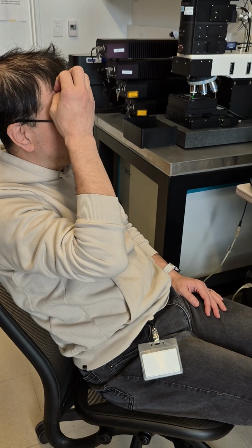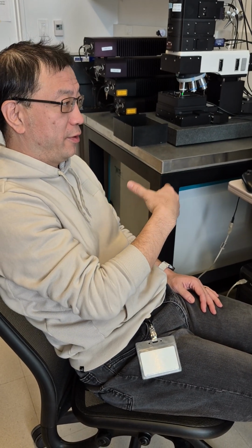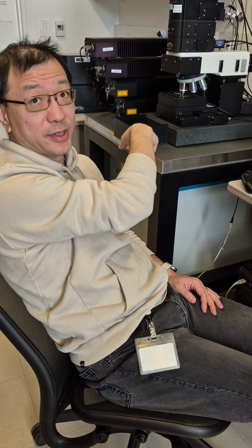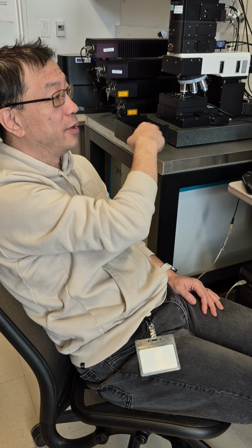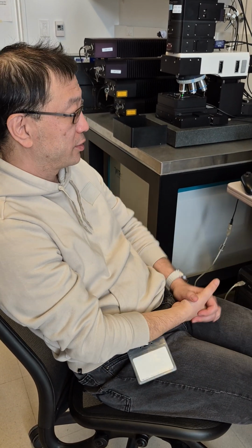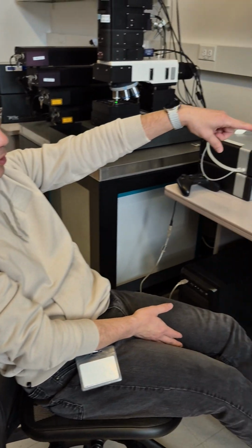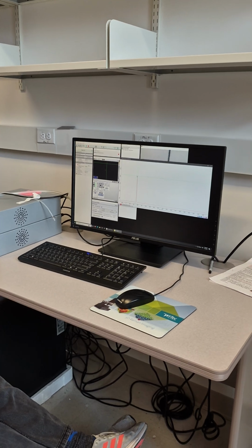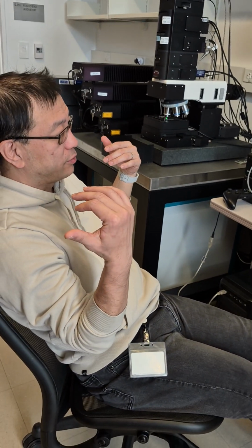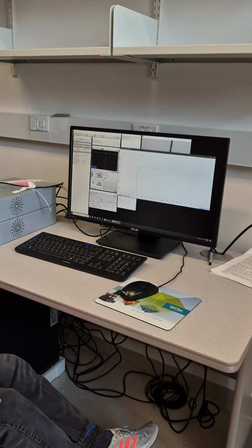Understood. So in the beginning, before you become experienced, I always suggest that you come in and work with this standard silicon sample, and you can get a good peak with the 532 laser, 20 milliwatts. Remember, we got the 1300 counts. So when the laser drifts off, of course your peak will drop.